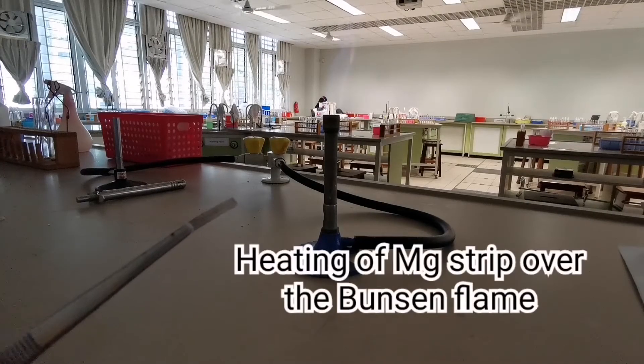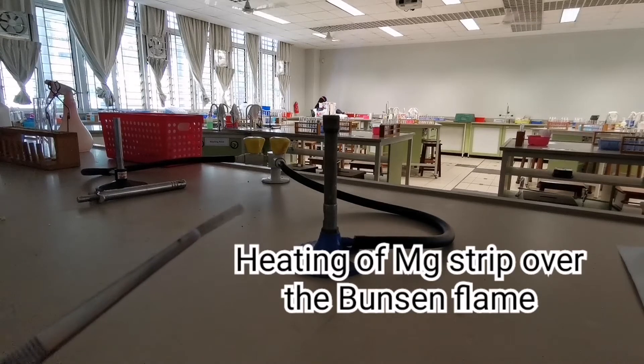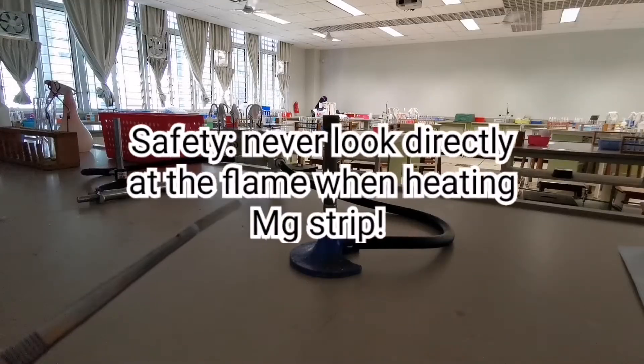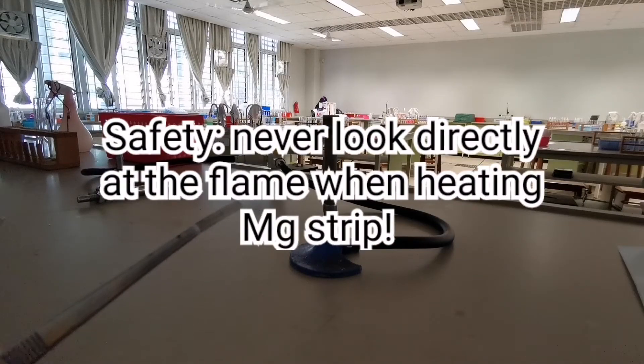Now, observe carefully what happens as we heat the magnesium strip over the Bunsen flame. A safety precaution: never look directly at the flame or the magnesium strip as it is being heated over the Bunsen flame.